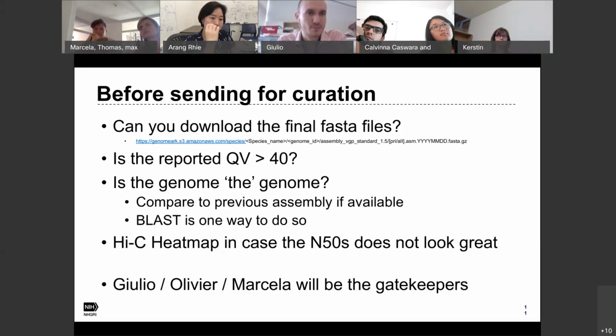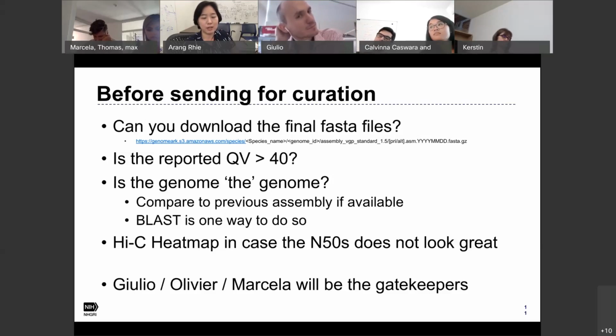Just to let you know that I agree that it's good to check the QV improvements every time. If you see the QV is not getting any better, that means there could be something that happened silently during FreeBayes polishing. Either your Long Ranger failed or didn't properly polish the variants.